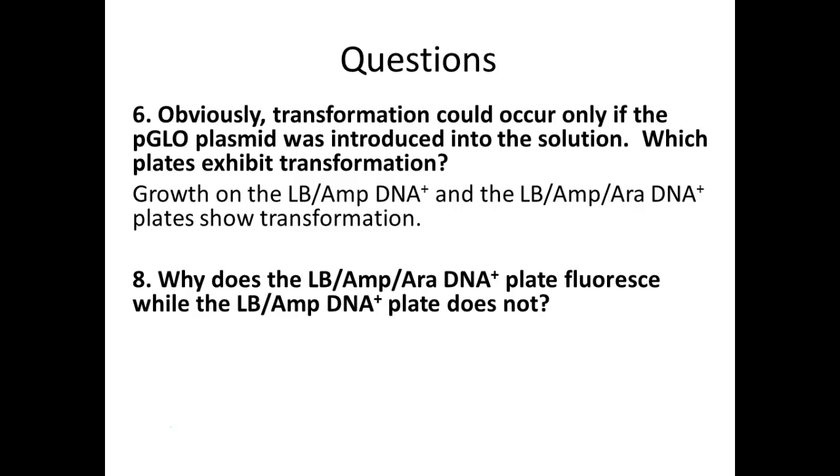But why is our arabinose plate going to glow and not our ampicillin plate? Go ahead. Why is the arabinose plate going to glow?